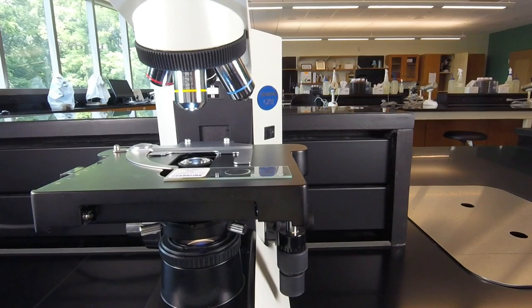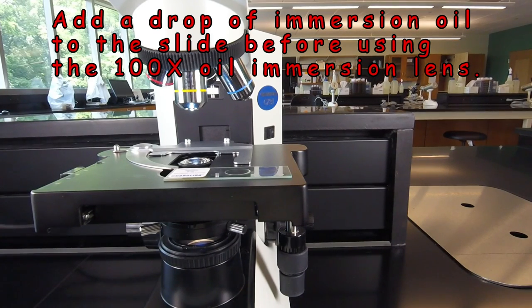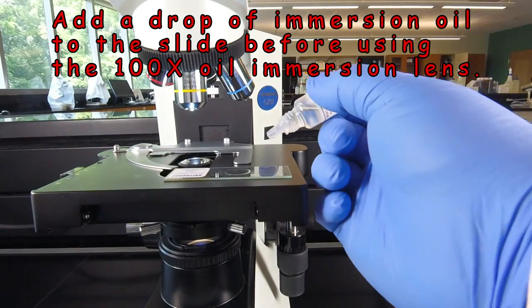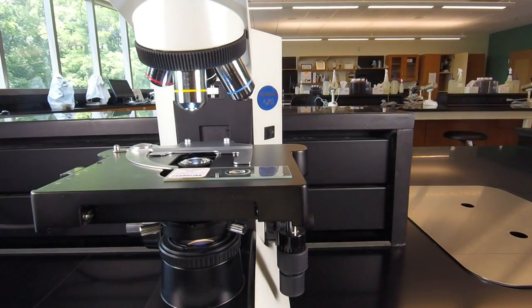Then since we're going to be using oil immersion microscopy or a thousand magnification, whenever we're using a thousand magnification, we have to put a nice sized drop of immersion oil where you're going to be viewing the slide. So you let a nice round drop fall like that.